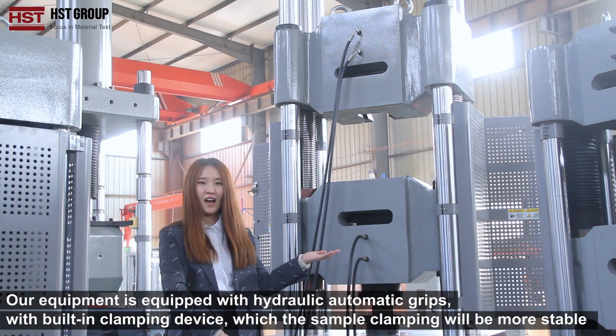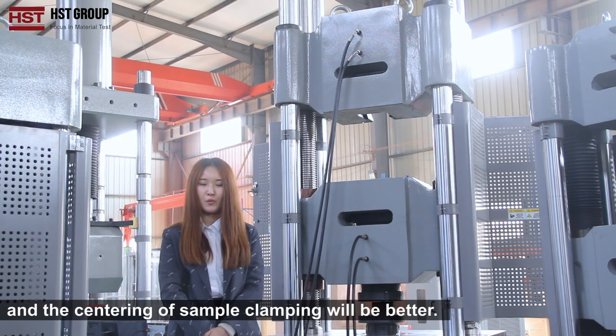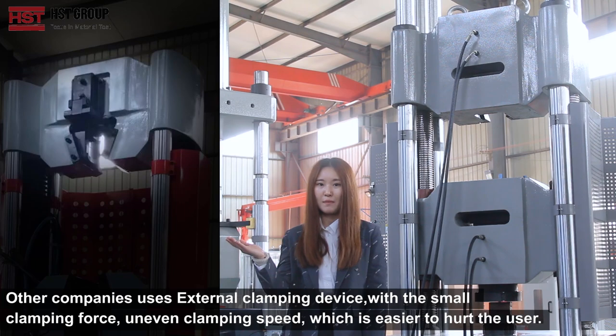Our company uses hydraulic automatic grips with a built-in clamping device, which makes sample clamping more stable and centering of the sample clamping better. Other companies use an external clamping device with small clamping force and uneven clamping speed, which is easier to hurt the user.